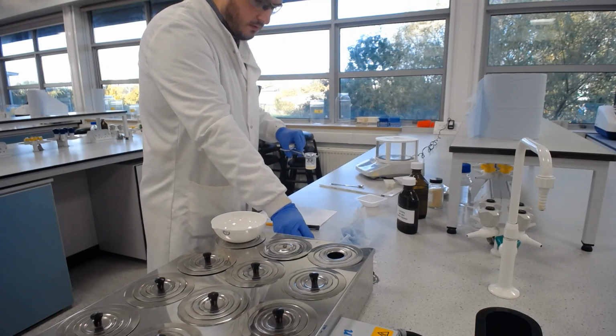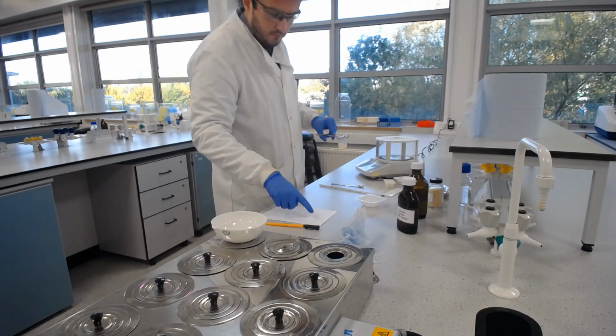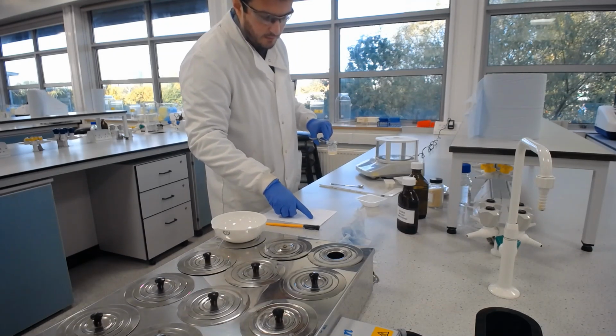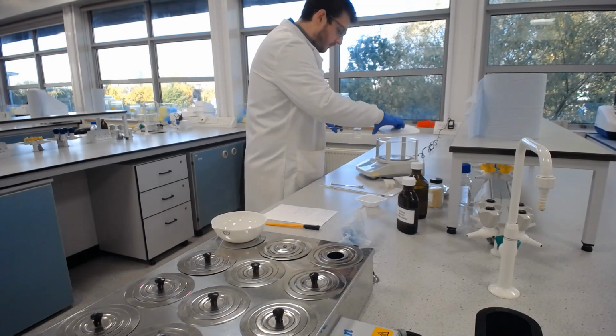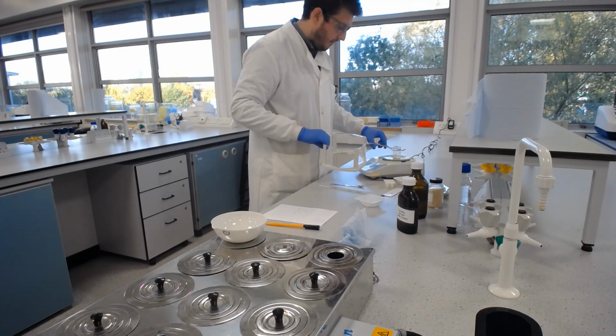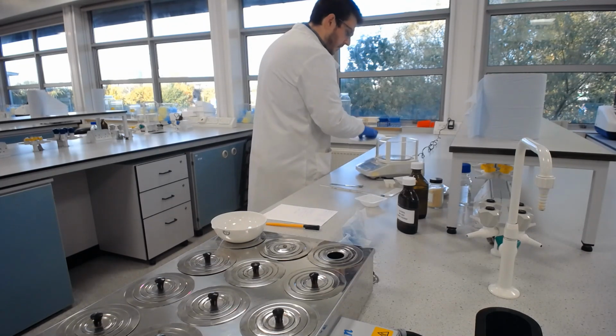I'm going to just weigh this again now. So I need to zero the balance and refer back to what I need to get to. I need to get to a final mass of 23.537 grams. So I'm just going to put that on the balance. And I can see I'm at 26.5. So I need to get rid of 3 grams of water.